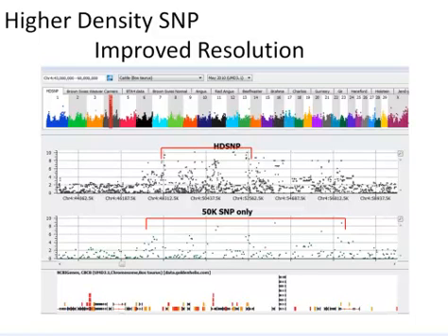It was a couple months ago, so they may have more. But from what we've seen so far, it's not a CNV. Now, if none of these next SNPs that we test are 100% concordant, that's something we'll come back and look at. Unfortunately, because we did pooled sequencing, we were eager to do the sequencing and didn't wait a couple of months until the indexing came out. Because of that, we really can't look at the CNV as much, because our sequences are not individual animals; it's a pool. But if we don't get anything, then CNV analysis would be something else to look at later on down the road.